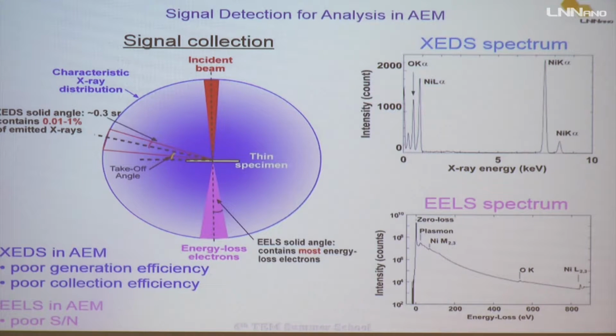And then we start to have some problems. This is why people like to compare EELS with EDS, because EDS is much more problematic in measuring the signal.